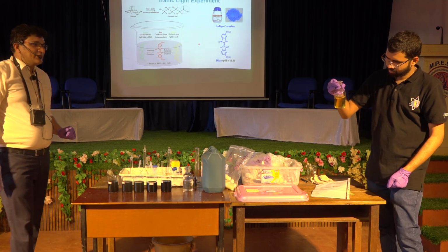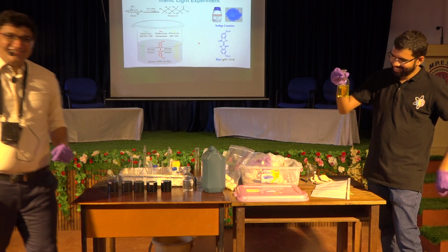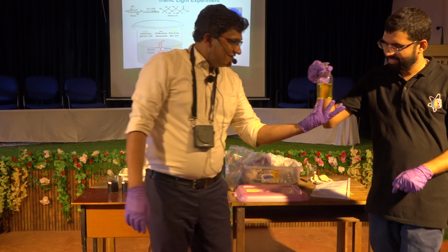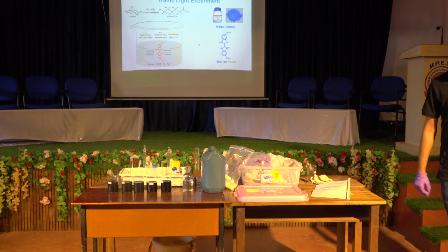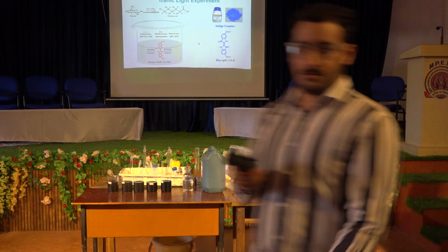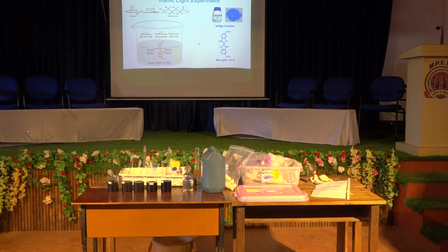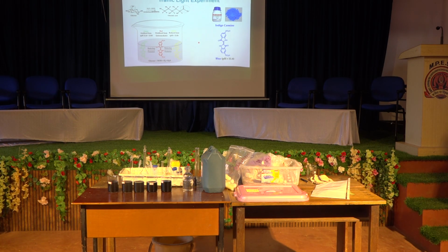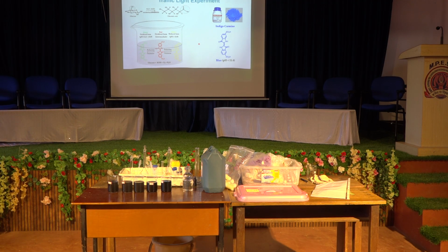Very slowly. It's turning into red. Okay? So you see this is yellow, right? What is the color now? Green, right? Now you are going to say what happened to green. It's light green, meaning green is going.